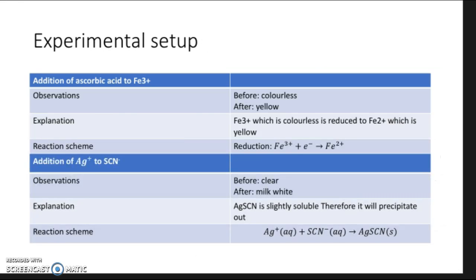In our experiment, we are going to stress a specific reaction in all sorts of ways. One of these ways involves decreasing each of the reactants individually, and doing so requires a particular chemical method, which will be described now. One of the reactants is iron 3+, whose concentration can be decreased by reducing iron 3+ to iron 2+ with ascorbic acid as the reducing agent. This is observed by a change in color.